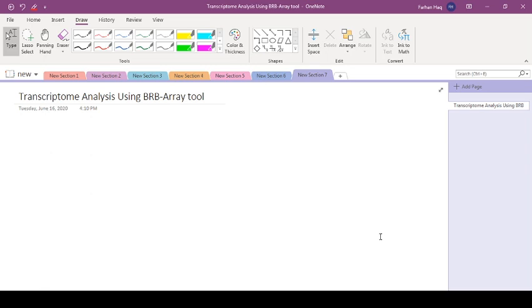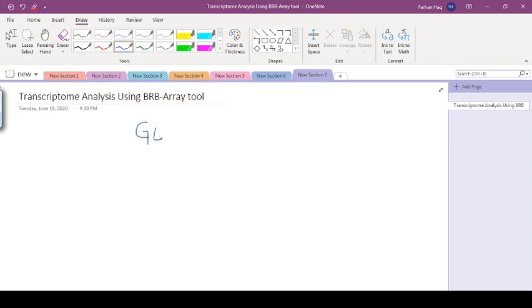In this tutorial, we will discuss how to perform transcriptomic analysis using BRB-array tool. In the previous two tutorials, we discussed how to download the BRB-array tool and install it in your computer, and then we discussed how to download datasets which should be analyzed on BRB-array using GEO Omnibus database that is part of NCBI.